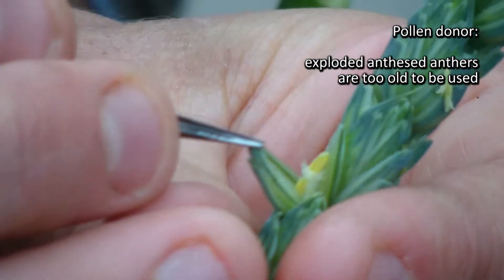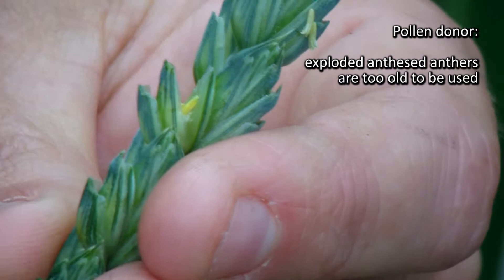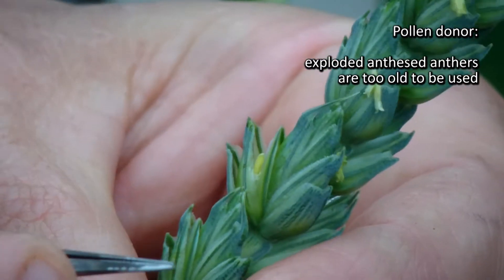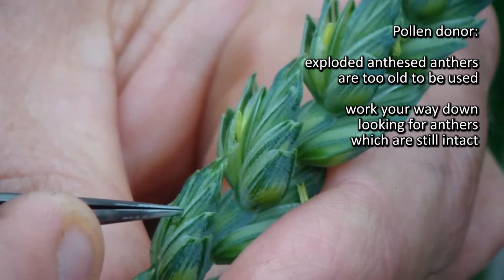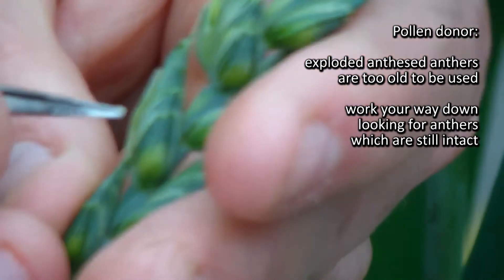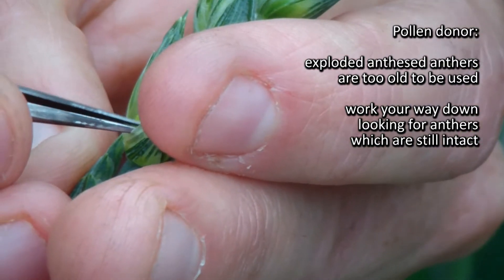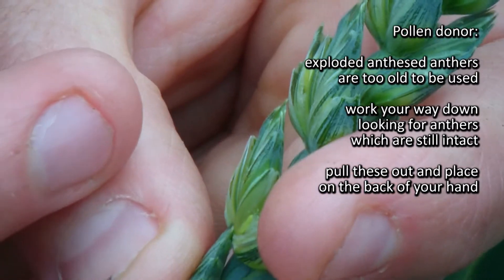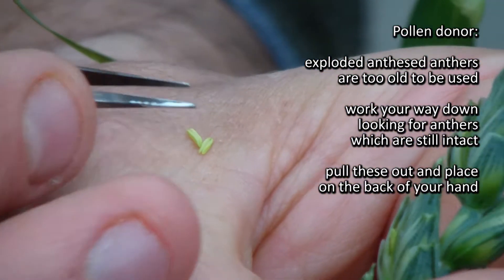The first one we look at is too late. Although the anthers are not extruding, they've already exploded — they've already gone through anthesis. So you work your way down until you find some anthers which are still intact. This looks like that to me, so I'm going to pull those out and put them onto the back of my hand.